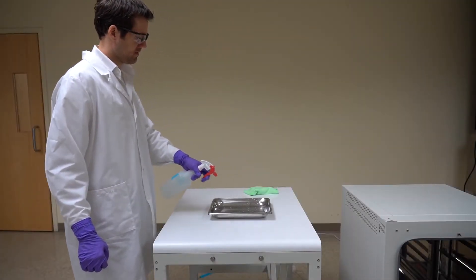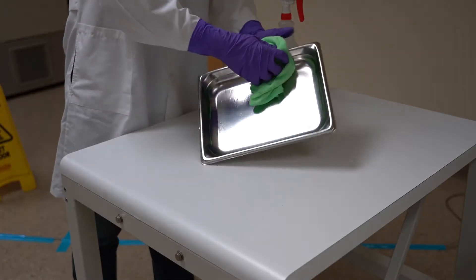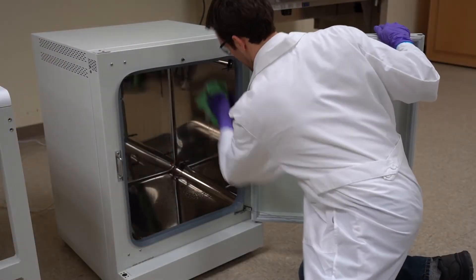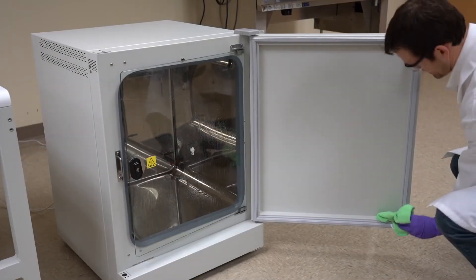Start by following your laboratory's procedures to clean the stainless steel water pan. Continue to follow your laboratory's procedures to similarly clean the incubator interior.